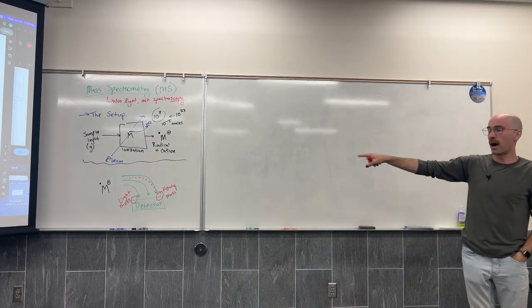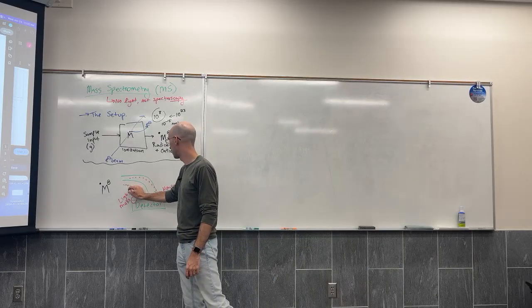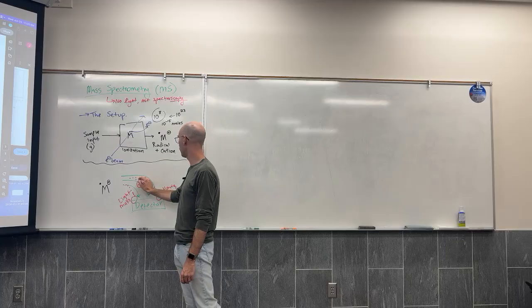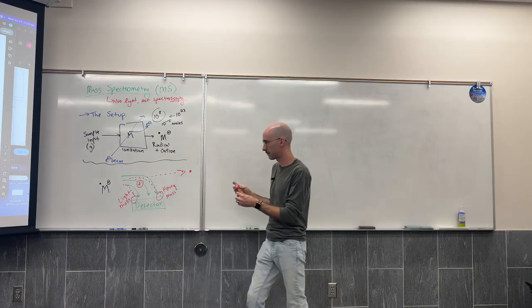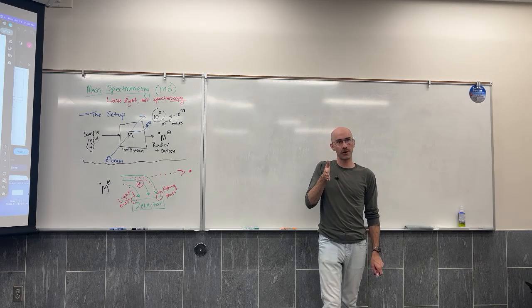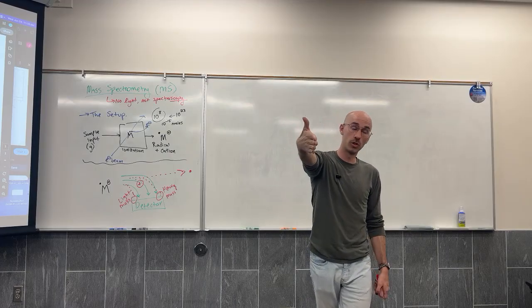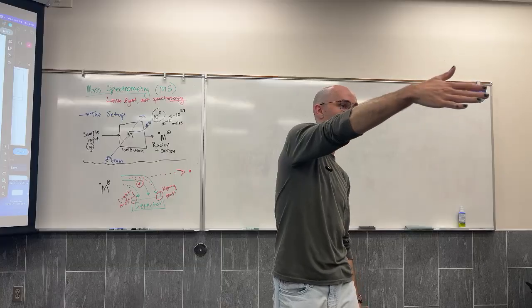Okay, so positively charged things get pulled to the detector, but radicals aren't affected by the magnetic field. So these samples are flying in a straight shot, and then they lose an electron, they become charged, and then they enter a magnetic field.